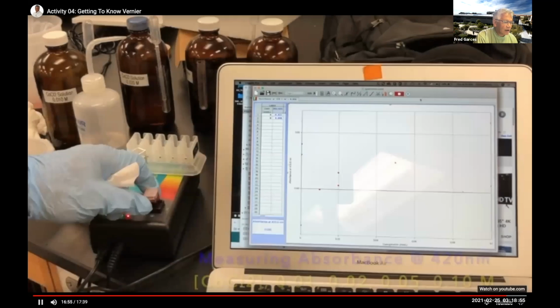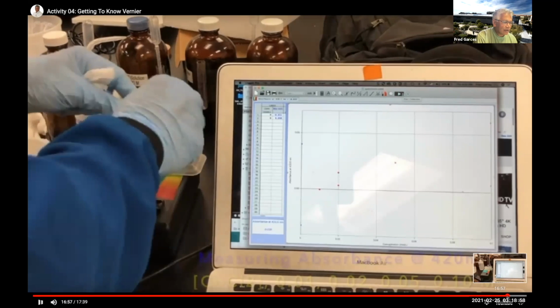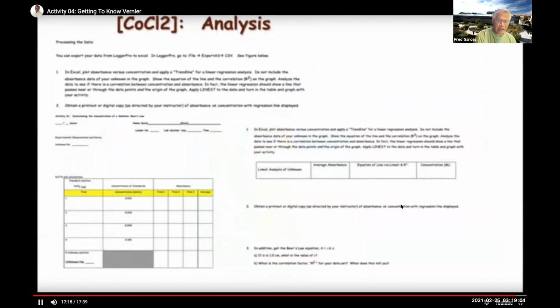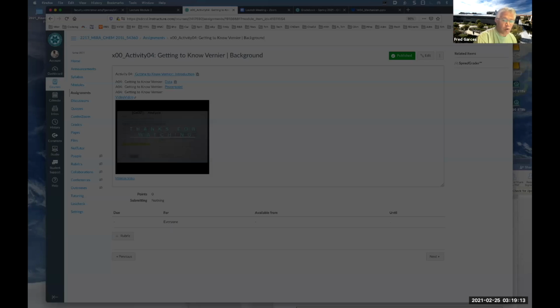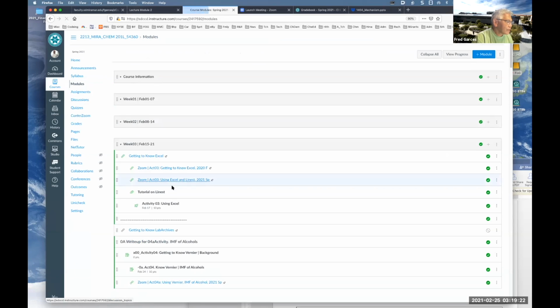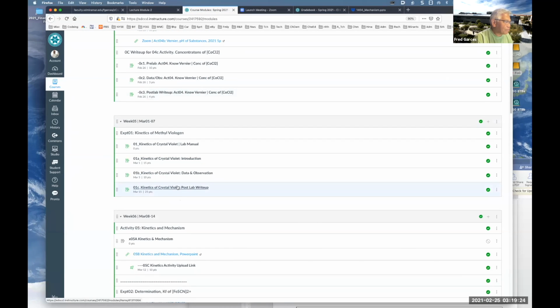Okay, and then from here, I think you have the data set. You have the data set, and this is basically it. It's not quite a straight line, but you can basically use that calibration curve. So that was the experiment in fast motion. Okay, so I wanted to show you that. Let's go back to the module page, and let's talk about that part.